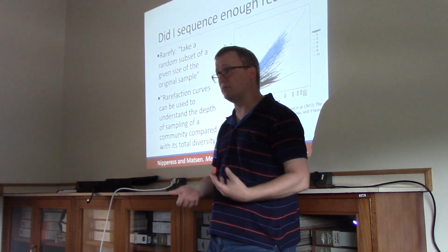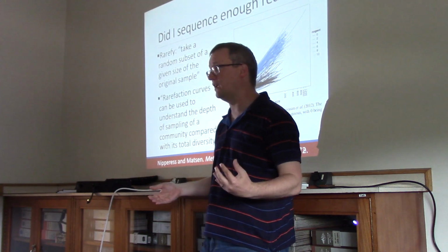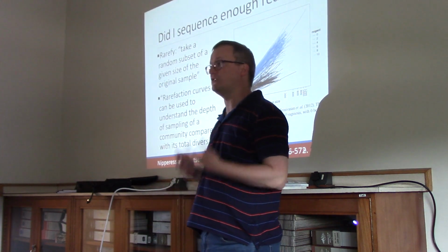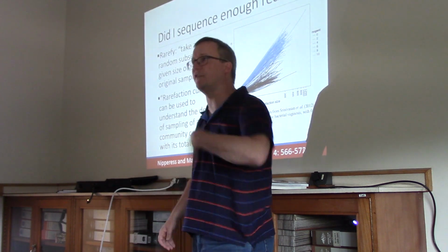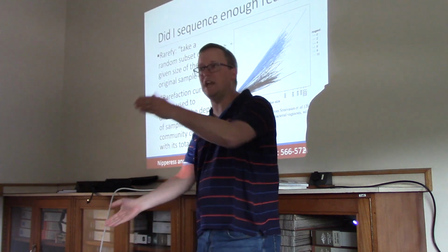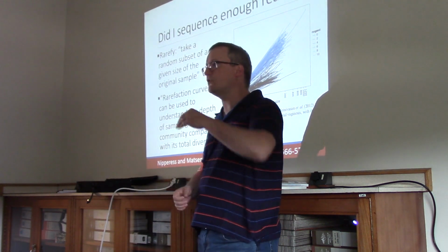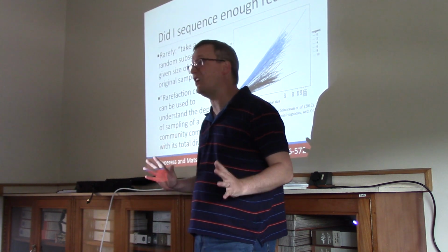This rarefaction procedure helps us to get a sense of how comprehensively we've done this. So from your 100 million reads that you've produced in an experiment, you could do a 50% draw from that 1,000 times over, and for those 1,000 experiments, see how many OTUs are represented by the data set. And if those numbers dance around a lot, that's worth being cautious about.